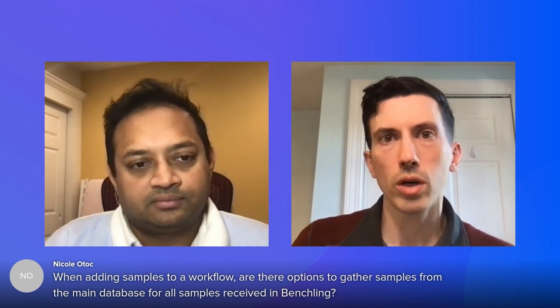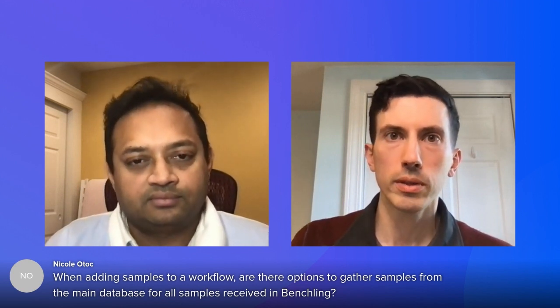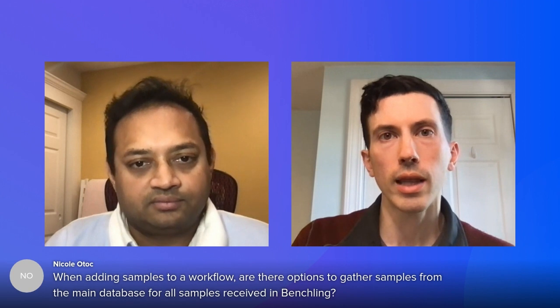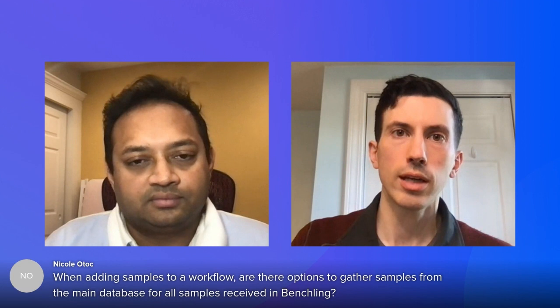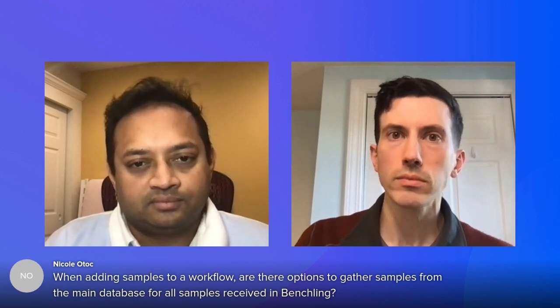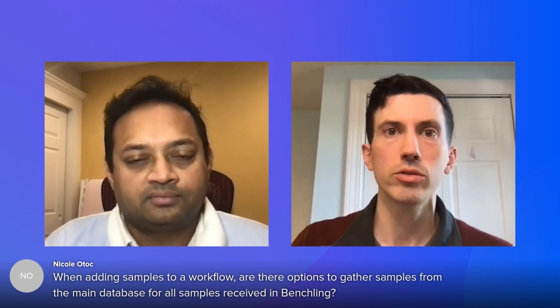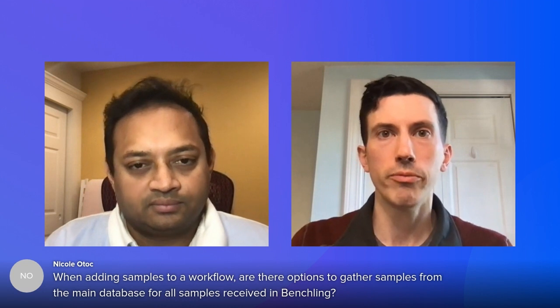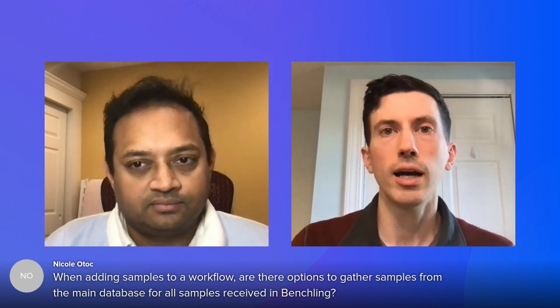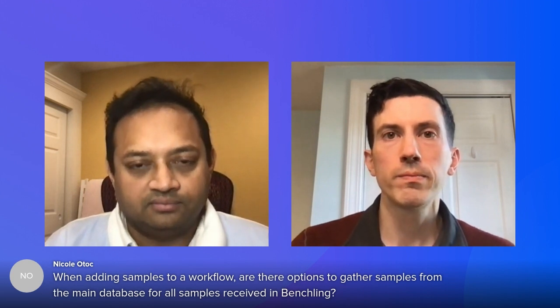And specifically to workflows, there's full searchability and filterability of the samples in that workflow, the task rows, and you can batch together samples that may span multiple different workflows. So if I'm an analyst, I can pull things and batch together to fill my assay plate that I'm running, per se. Cool. Thank you, Tom.